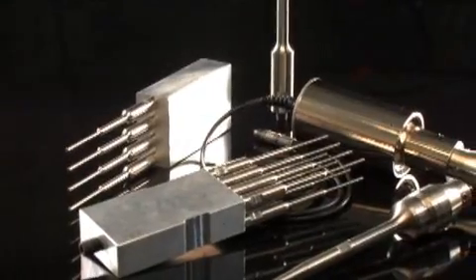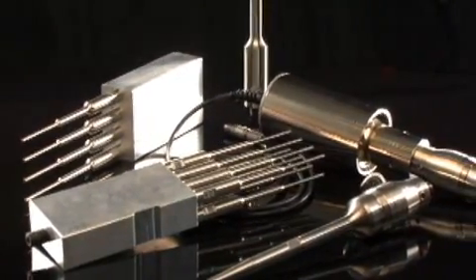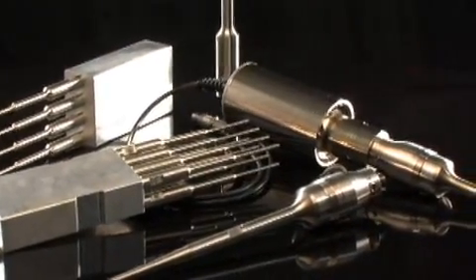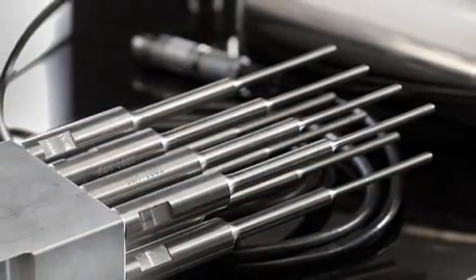Sonics' multi-element titanium probes maximize productivity and address tedious, labor-intensive tasks by processing numerous samples simultaneously.